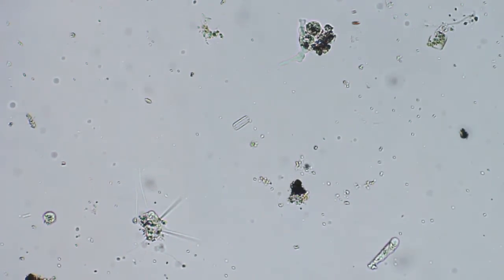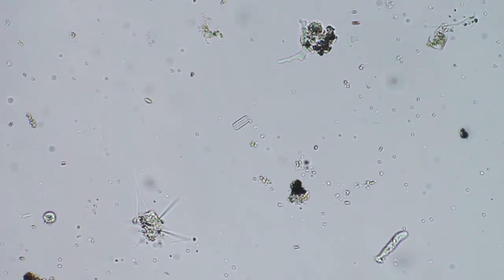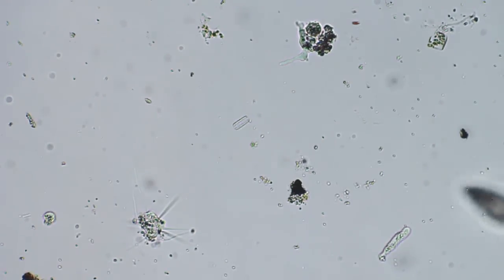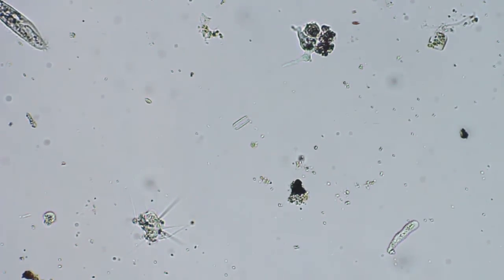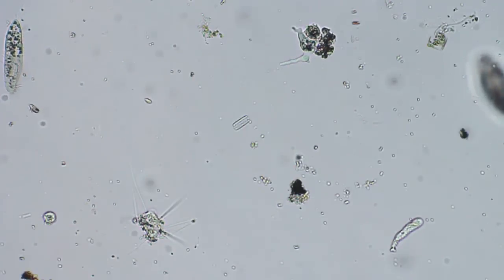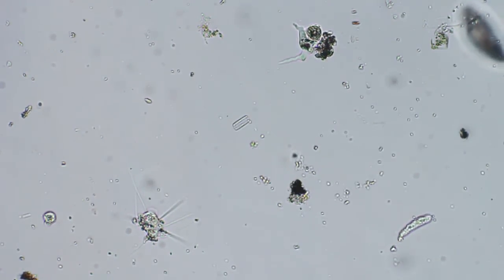There's that other amoeba up there at the top. Let's take a break here. Thank you.